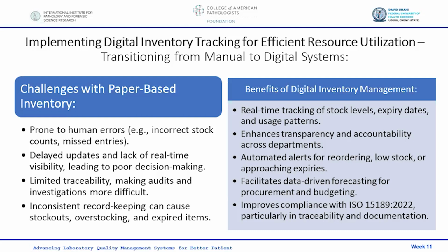What are the challenges of a paper-based inventory? It is prone to human error, for example, incorrect stock counts, missed entries, and all of that. It's associated with delayed updates and lack of real-time visibility, leading to poor decision making.